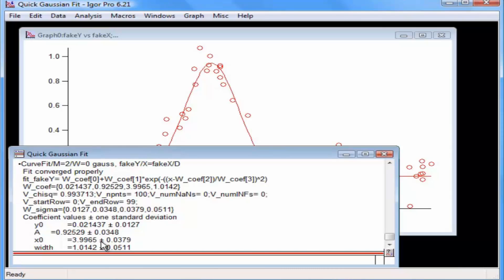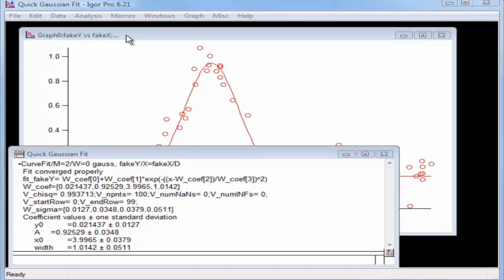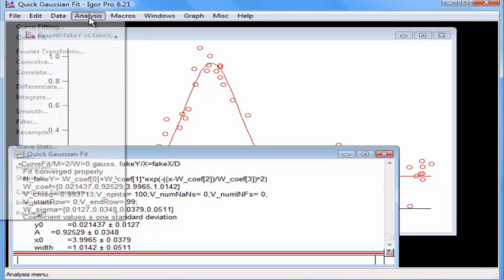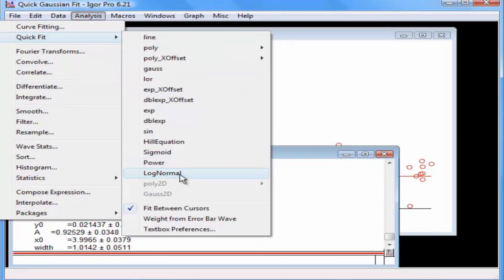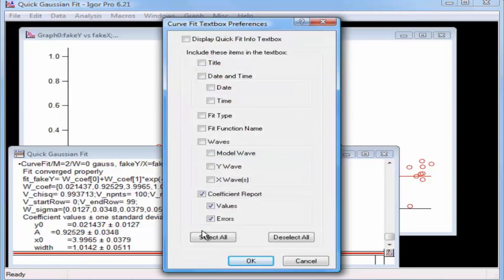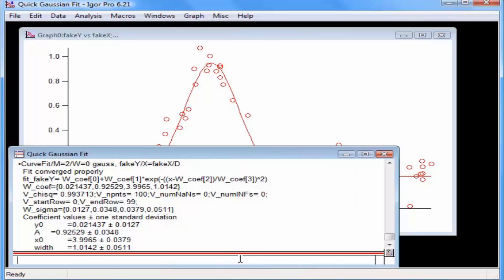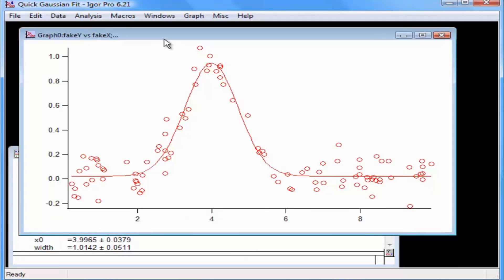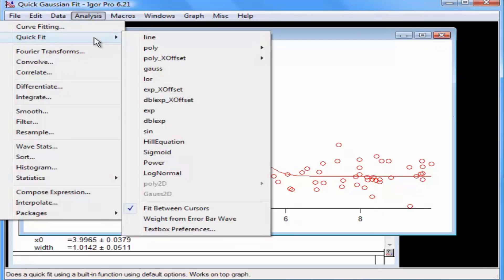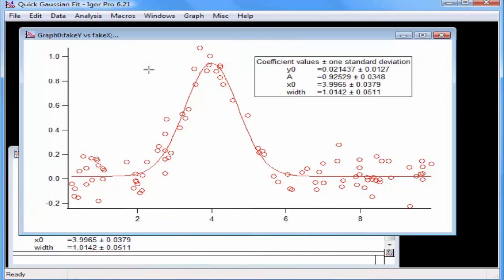Let's add this information to the graph. Select Analysis > Quick Fit > Text Box Preferences. This opens the text box preferences dialog. At the top of the dialog, check the 'Display Quick Fit Info Text Box' option, then click OK. Click the graph window to bring it to the front, and select the Analysis > Quick Fit > Gauss menu item again. This fits the data again and displays the results in a text box in the graph.